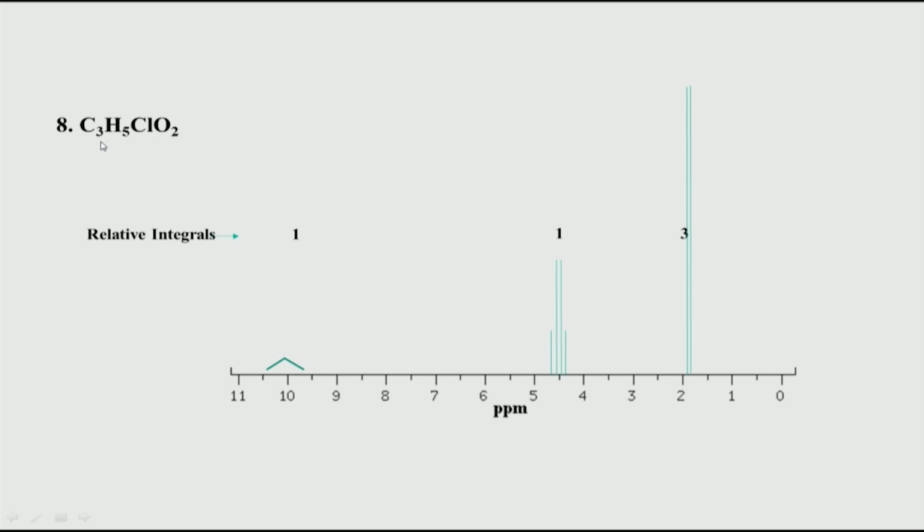In NMR the structural isomer can be distinguished by looking at the J multiplet pattern. With IR spectroscopy it is kind of difficult to figure out whether there is a branched chain, because as far as the functional groups are concerned, if they are the same, IR cannot distinguish much. Similarly, mass spec will give you the same mass for both systems. So, a regular mass spectrum will not help in deciding whether it is an isomer or not. NMR is a unique, nice technique where you can differentiate two structural isomers from each other.